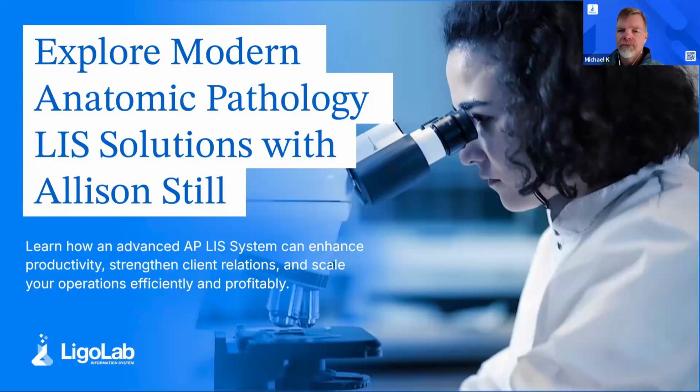We hope during the course of this presentation to show you some of the AP workflow that exists within the LigoLab informatics platform. And we certainly also welcome your questions after Allison's presentation. But first, let's get to know a little bit more about my two colleagues, Allison and Olga.